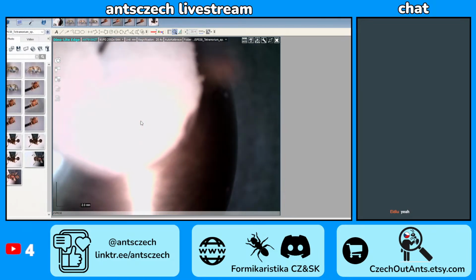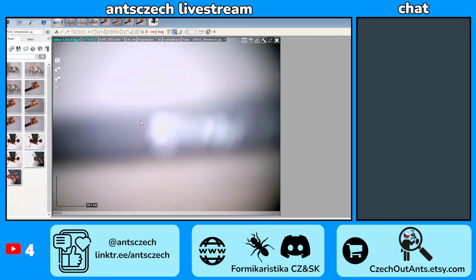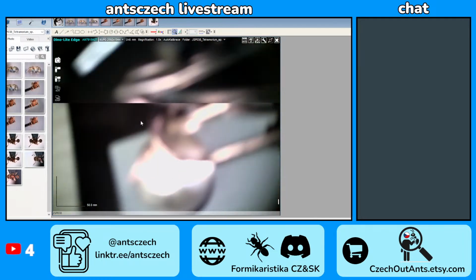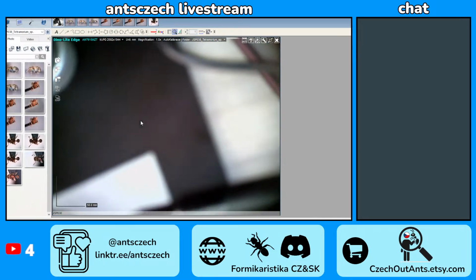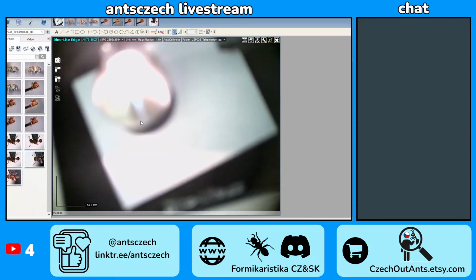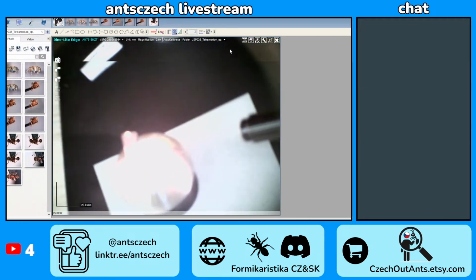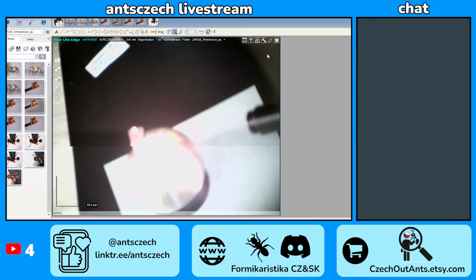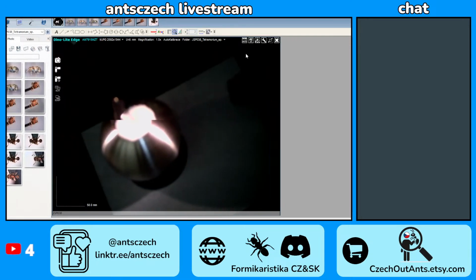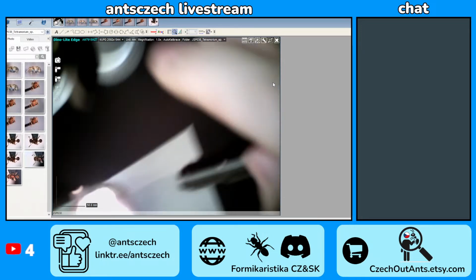Yeah. Okay, we won't be able to get a better view of the Entoball, I think. Or maybe? What if I do this? Whoops. It's too bright.